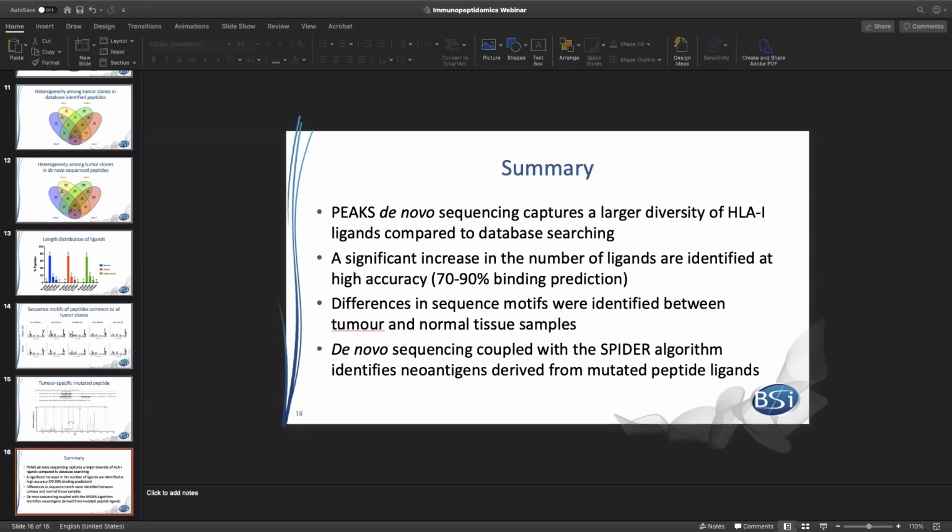So, have you looked into the details of their data? Yeah, it's all DDA data, and each sample was done in triplicate. Okay, so they eluted from 3 replicates for each sample. But I'm not sure how reproducible the peptide identification was across those triplicates. They're all just grouped together in peptide identification.